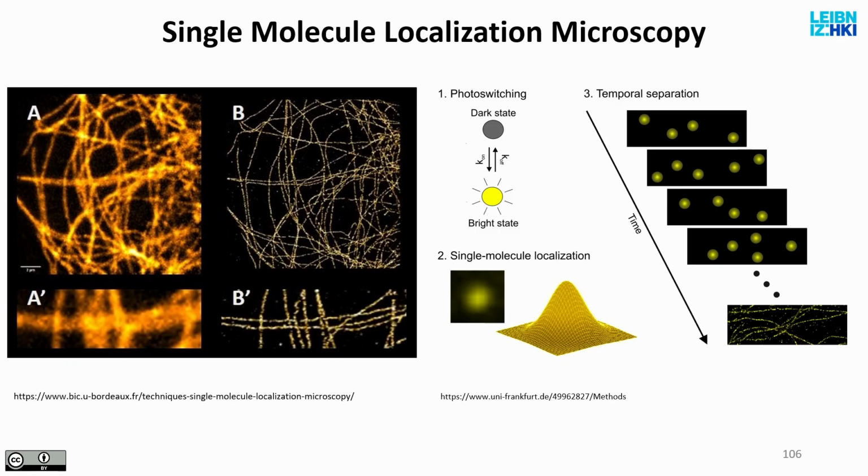And finally, the other possibility is that if you think about it, the whole problem was that two small objects, which are very close to each other, we cannot see because of the diffraction. And I cannot move the two objects apart because that will change the structure of the tissue.